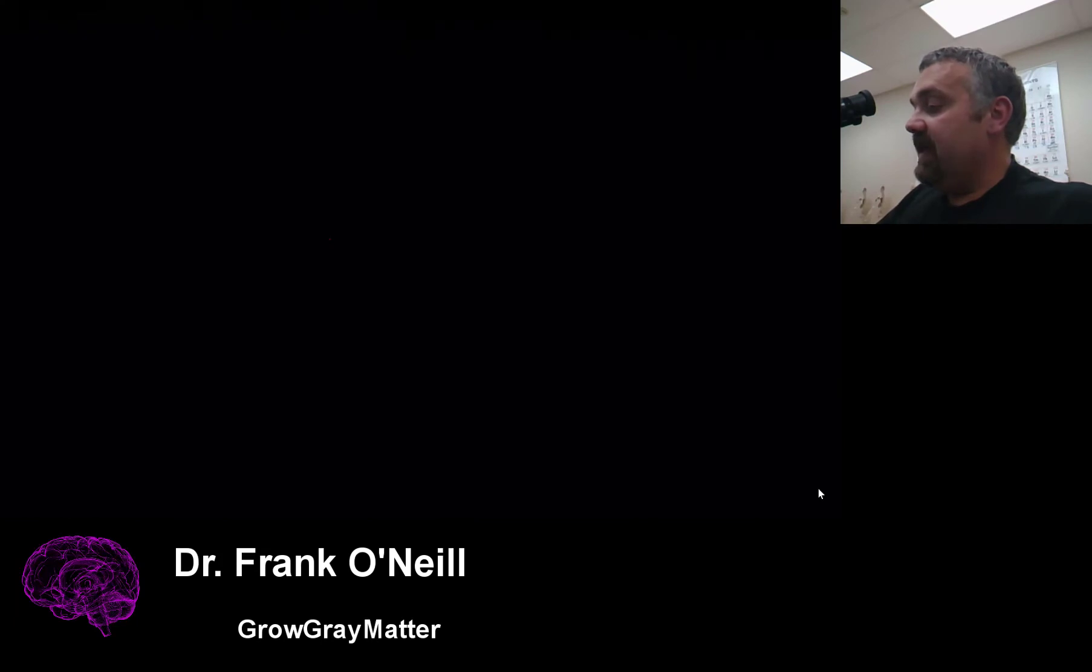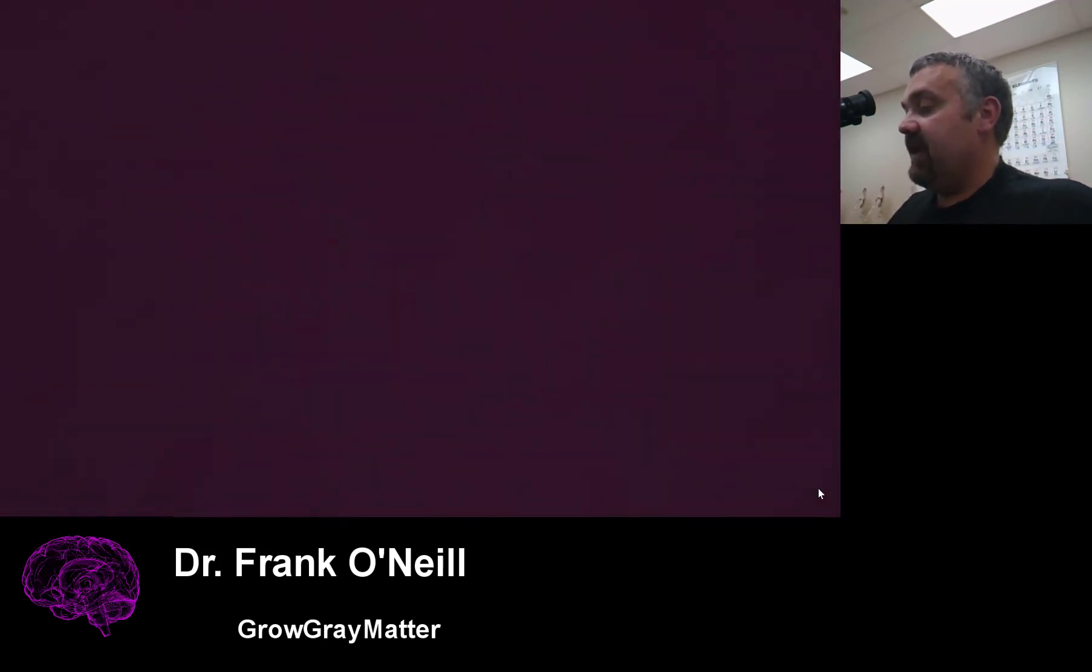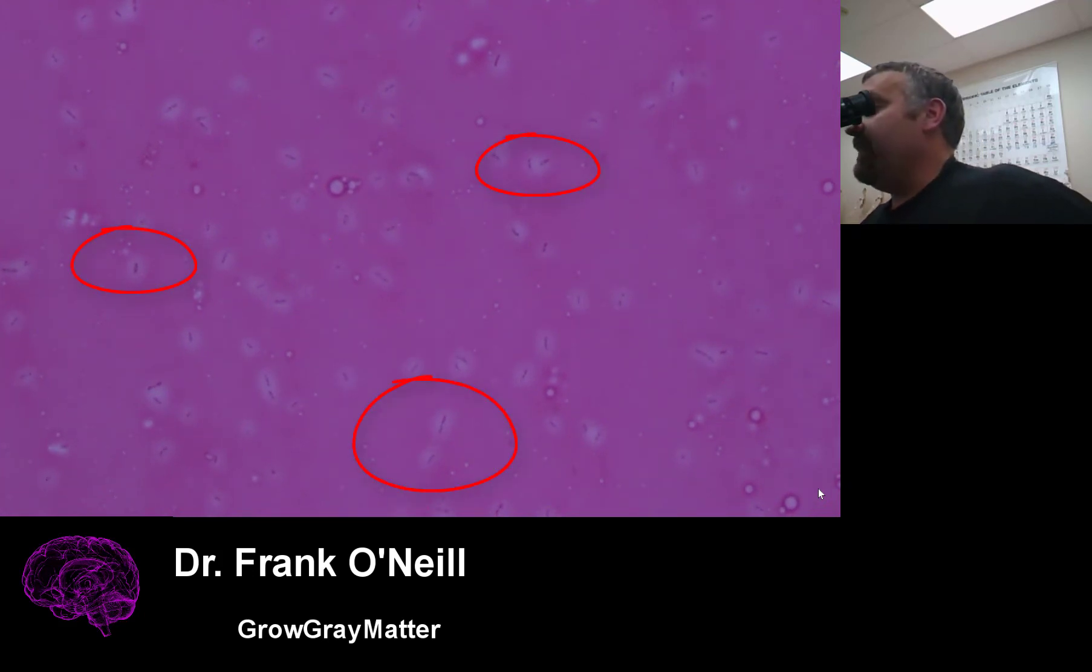All right, about there it looks really good. Then I'm going to go to the high dry power, the total magnification of 400x. I do have to change the lighting a little bit so you guys can see this. And right here, we're actually starting to see some of these organisms and the capsules around them.